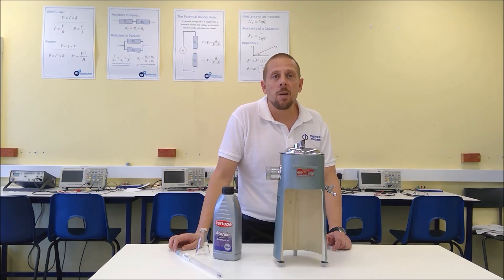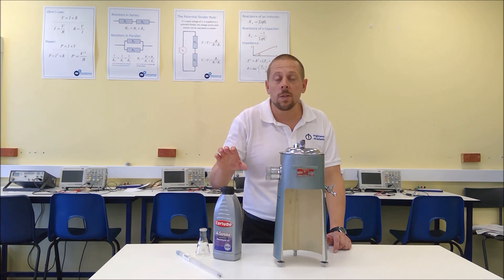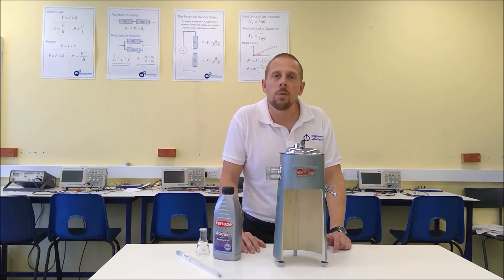Hello there, I'm Andy from the Engineers Academy and in today's experiment we're going to be measuring the viscosity of synthetic oil at various different temperatures.